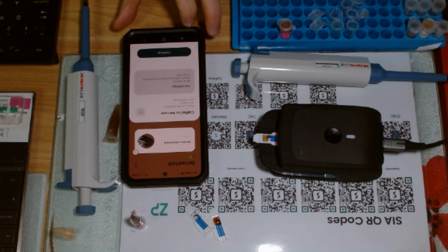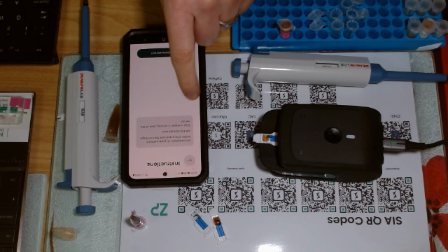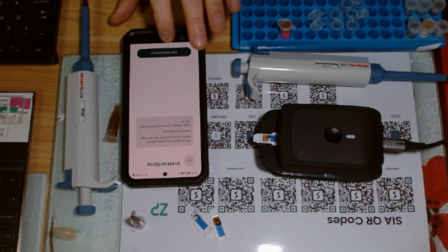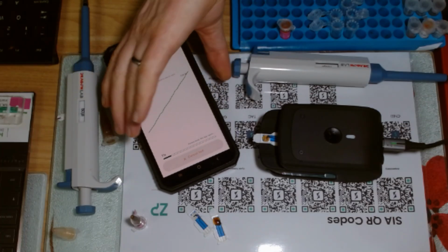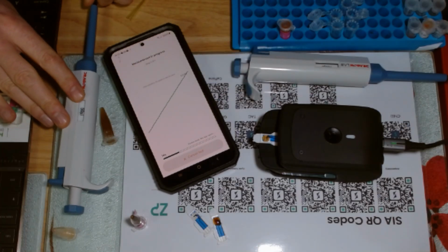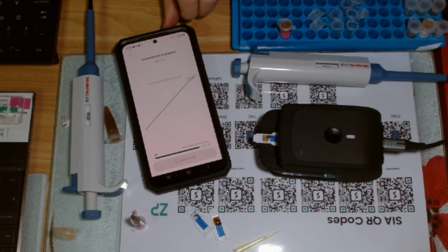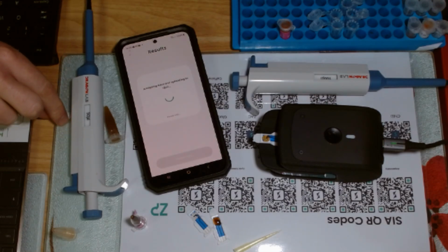Right, so I've got that on there, and I will think aloud a little bit. I've prepared it the way it says here. I've put 50 milligrams in 1 ml, because that's doing like a 1 in 20 dilution. I will just hit start measurement, and off it goes. It's a different sensor, different assay, and you will obviously get a very different looking result. But the reason I was talking about Djuli quite so much earlier on is because the numbers are useful to us, but I actually want to show you that I'm getting a lot of information out of the raw signal as well.